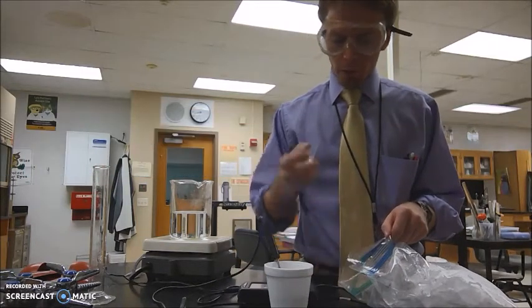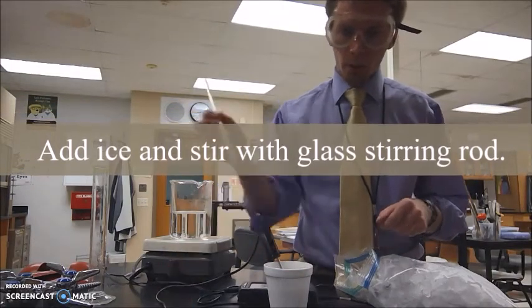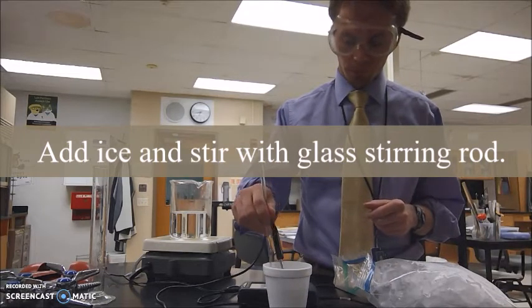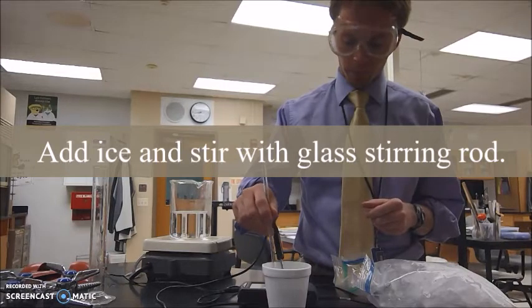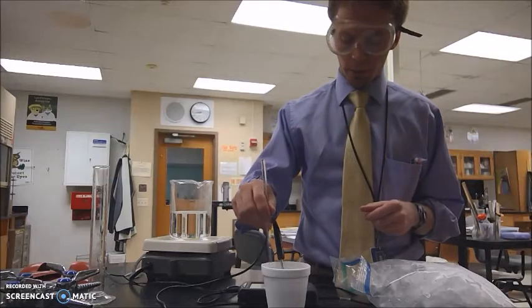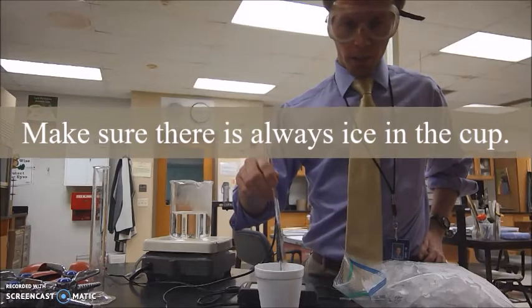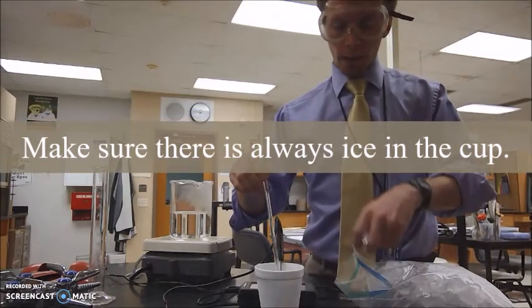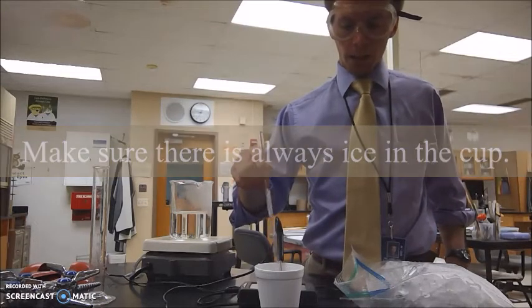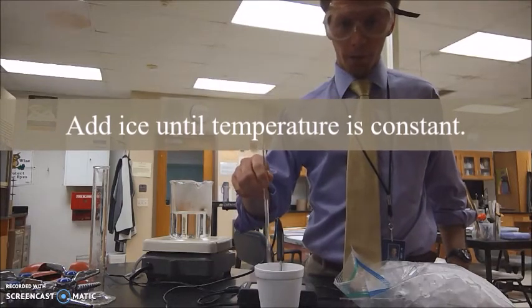What you'll do now is you're going to add ice, and then you're going to gently stir it. You should see a rapid spike downwards in the temperature. If it looks like you're about to lose all of your ice because it's melting, go ahead and add a couple more cubes. You always want ice present in here, and you're going to keep adding ice and letting it melt, and then adding more ice until your temperature levels off.